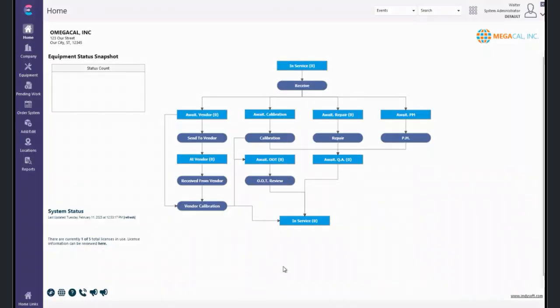We'll go back to the main screen of calibrations.com. And the example that we're going to use is yesterday I went ahead and did a print label event change where we modified the label size choices and added a new choice. There are 3 parts of this workflow that we'll demonstrate to show the overall aspects of the event change. So first, we'll go into the workflow configuration to show how we actually made the event change. Then we'll show the configuration change utility and how it automatically did an audit trail of the action that we performed. And then we'll go to the change control form, the completed form, to show how it would look when it's all filled out with an attached test script.